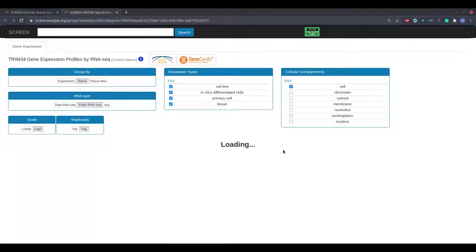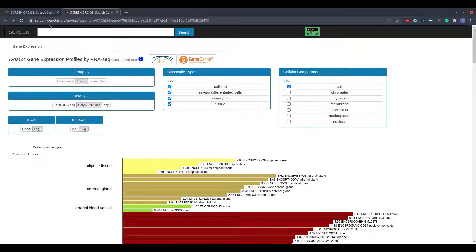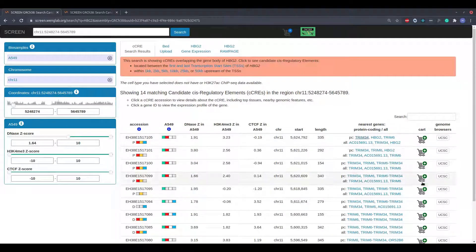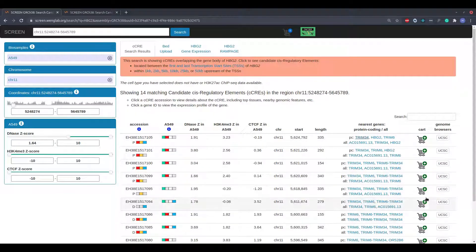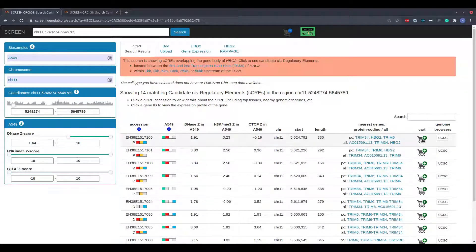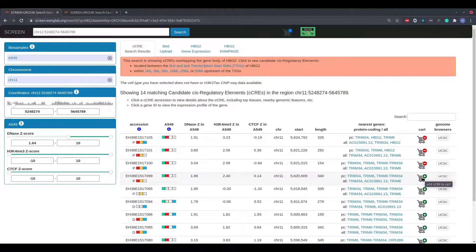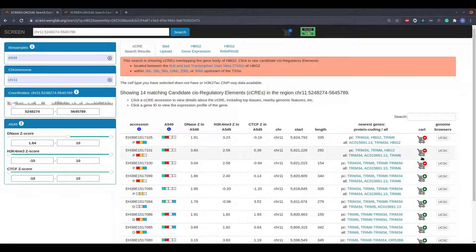The next column is a shopping cart column which allows the user to save candidate regulatory elements of interest across multiple searches. To add an element to the cart, simply click the plus icon in this column. Once an element is selected, it may be removed from the cart by clicking the minus icon.